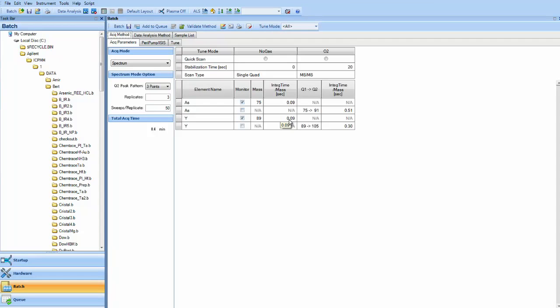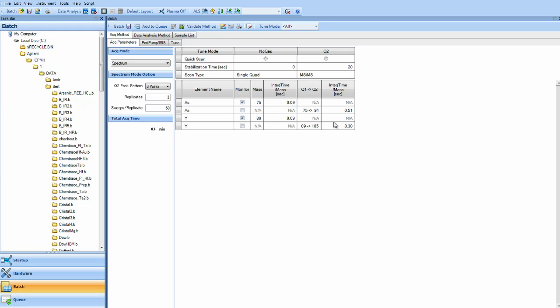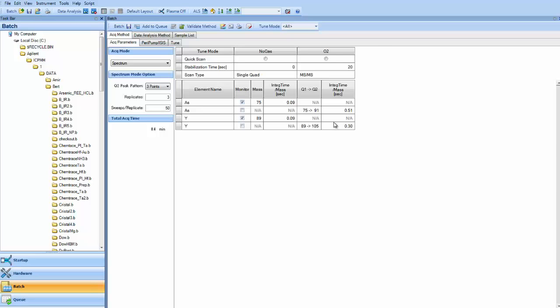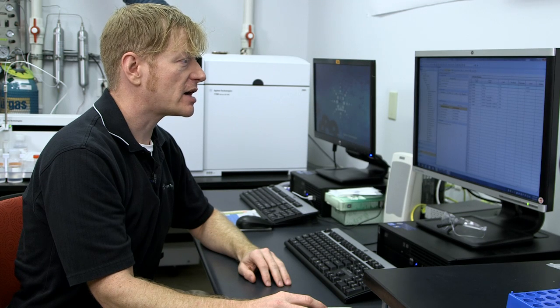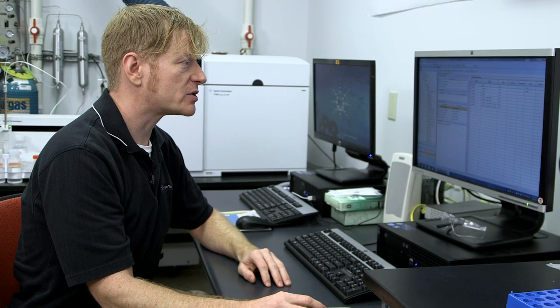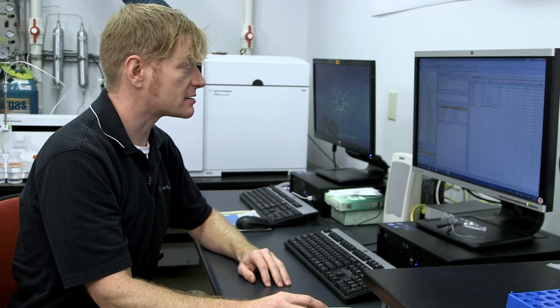We're going to run this analysis in no gas mode. So in other words, we are not removing these interferences. And then we're going to run in oxygen mode and do a mass shift from 75 to 91 and look at arsenic oxide, which will thus remove that interference. So now we're going to add to queue, which starts our analysis.